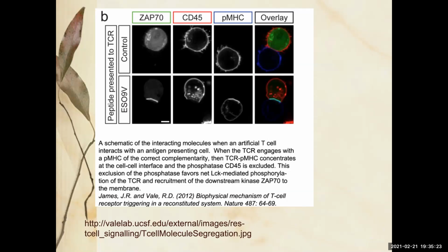Okay, so what we're looking at here are two cells. This first cell on the top, and then this second cell on the bottom. They're both quite round. Immune system cells tend not to have a lot of morphology, in other words, shape. It's a fancy science word for shape.